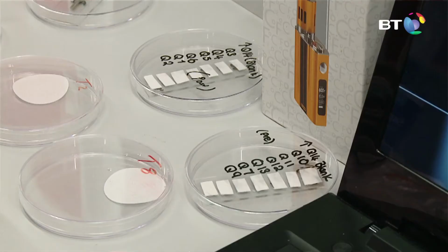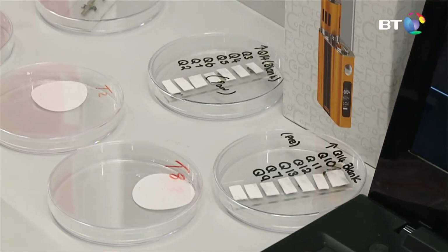And then in DIT, when we investigated the e-liquid, we found different components of the e-liquid using a Raman microscope and FTIR laser. And then we went back to Trinity College to test on lung cells, so it was lung cells that were incubated with the vapour on top of them.